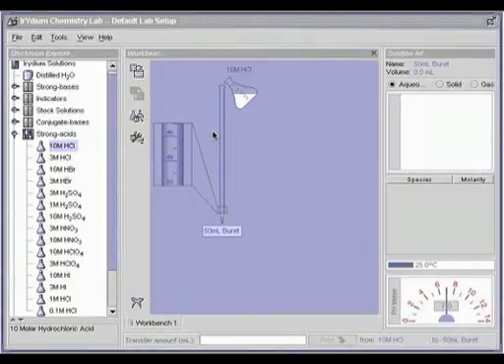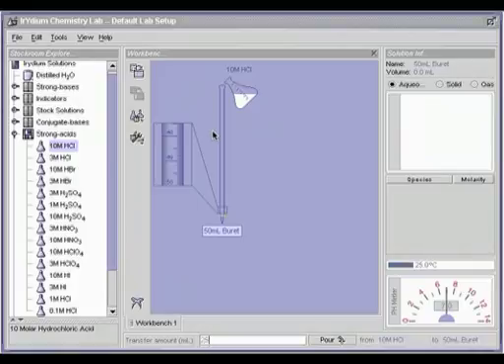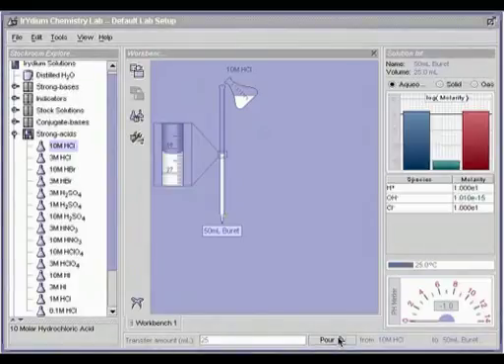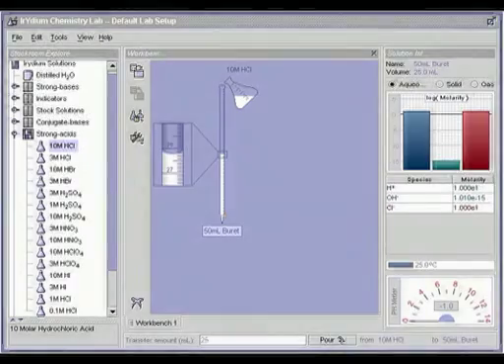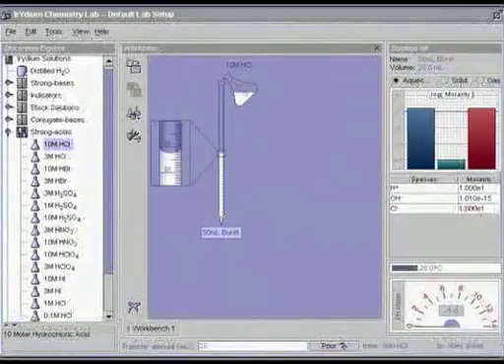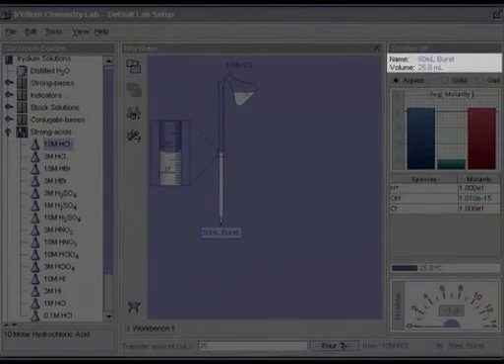So if you want to transfer 25 milliliters of the solution, just type 25 and click pour or hit the return key. Note the volume change in the solution info panel.